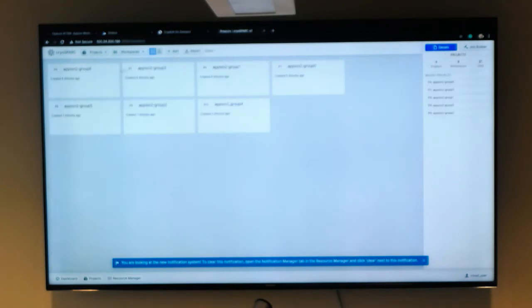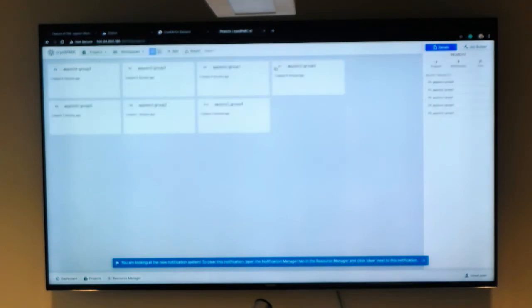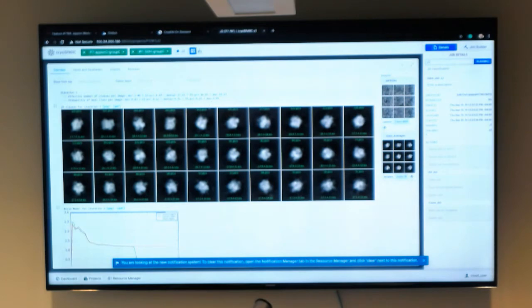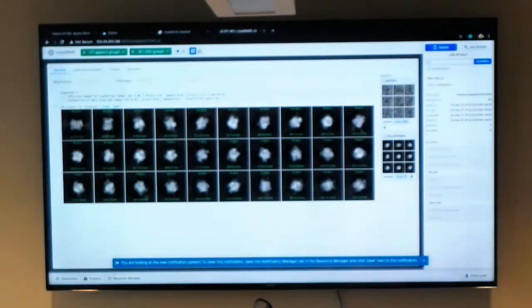And one advantage is that we have access to each group, so we can see where people are getting stuck. Again, I'll be working in group 0, and you can already see there's feedback. This is only iteration 1, but you can see feedback as it goes. Now it's on iteration 2. And very similar to what Relion did when you use fast subsets, you can see that this is only using a subset of images. Every iteration it uses a larger and larger subset, and it's not using the full particle stack. Right now, this iteration has only 9,000 particles.